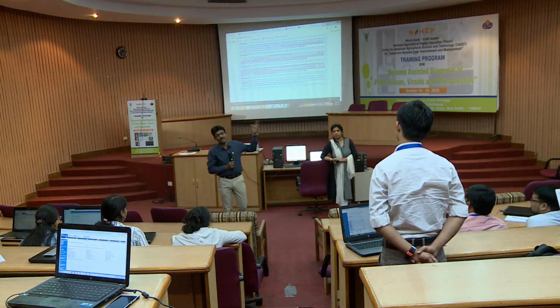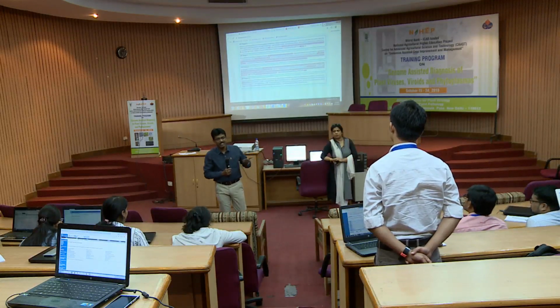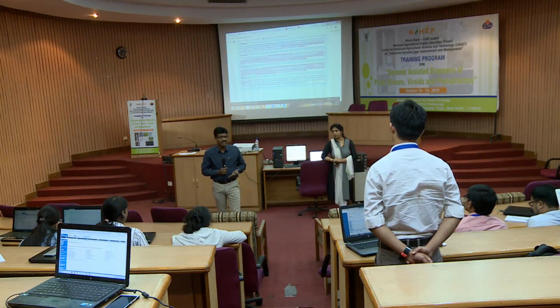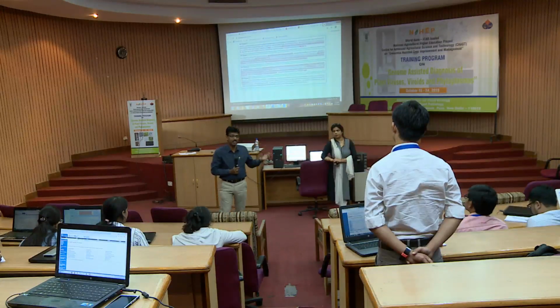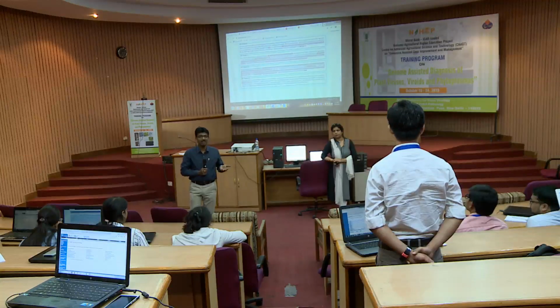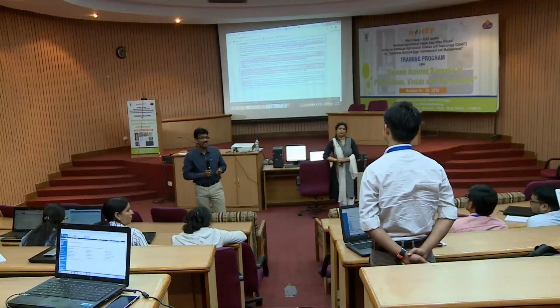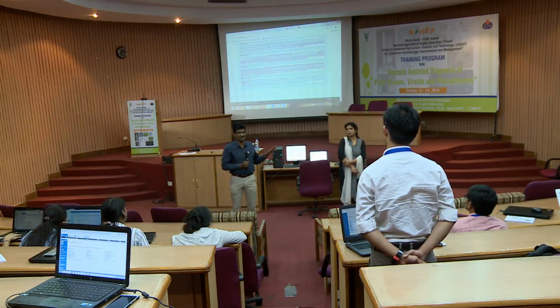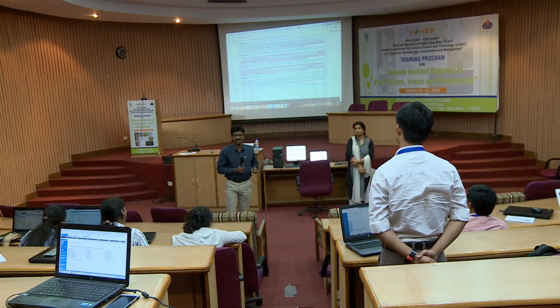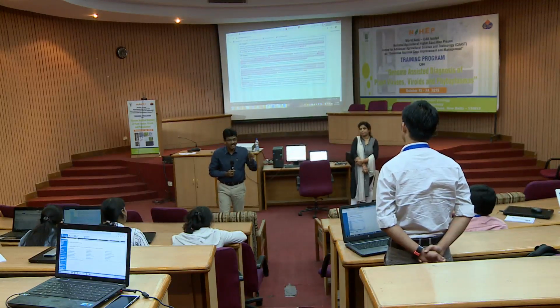And the curator will spend time on the chromatographic file. If you are telling that you have a gene sequence that is a different allele compared to the one already there, you are claiming a new allele for the sequence, then your claims are verified by the curator of those databases, and only then is he going to accept your claim, right? If a 100% match is there, then no problems, no complaints. If you are claiming novelty, then the problem comes, right? And how authentic your data is, whether it is a base call or a sequence error.